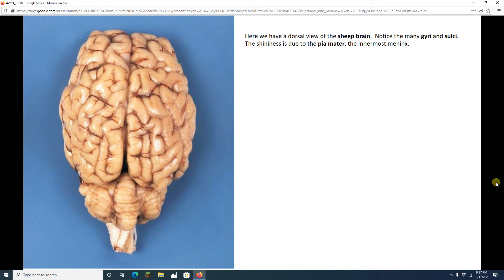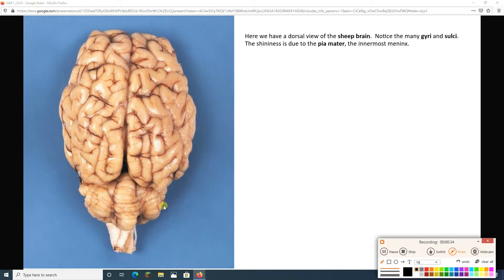This is a sheep brain — an incredibly awesome looking sheep brain right here. It's got gyri, the ridges here. It's got sulci — the grooves are sulci, of course. The gyri and sulci are there to give us more surface area. We need smart sheep. Absolutely.